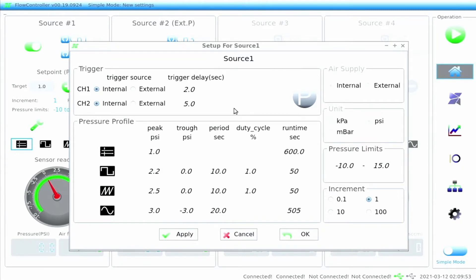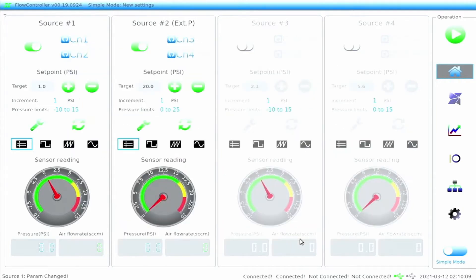If a flow sensor is connected to the flow sensor port for the source being adjusted, the gray P icon will turn to a blue F icon, and if the user clicks here, they can change flow control parameters. Clicking on the plus-minus icons will shift the target set point based on the unit increment, which was set using the wrench icon. Press the refresh icon to register the change prior to running the pump.